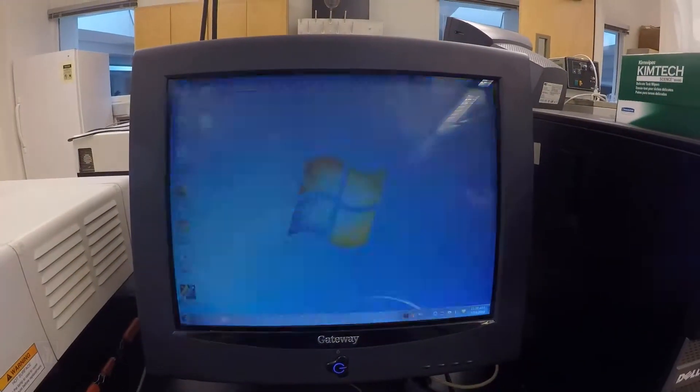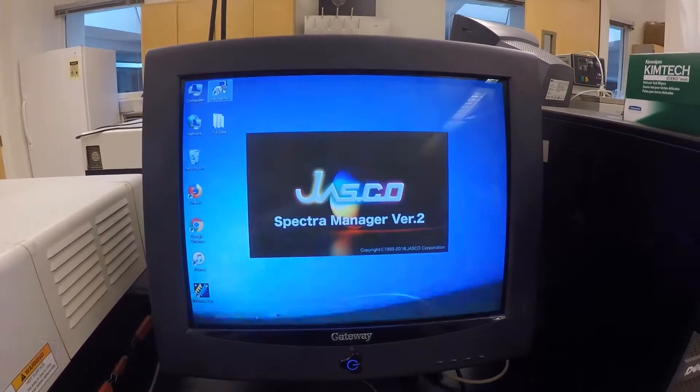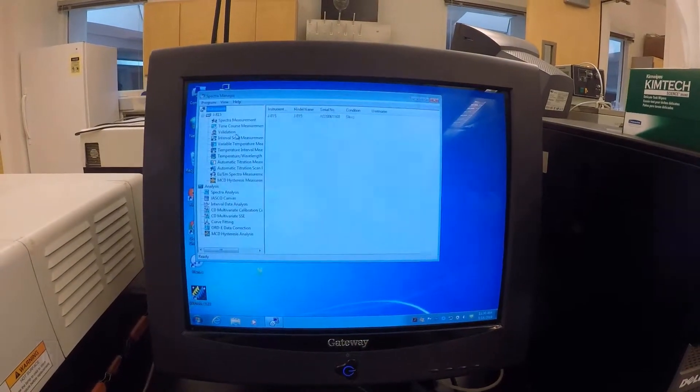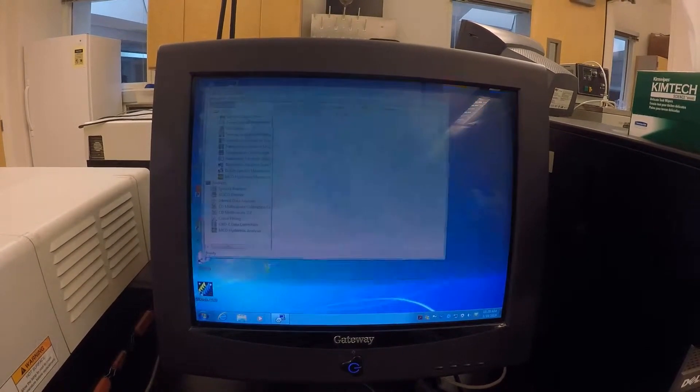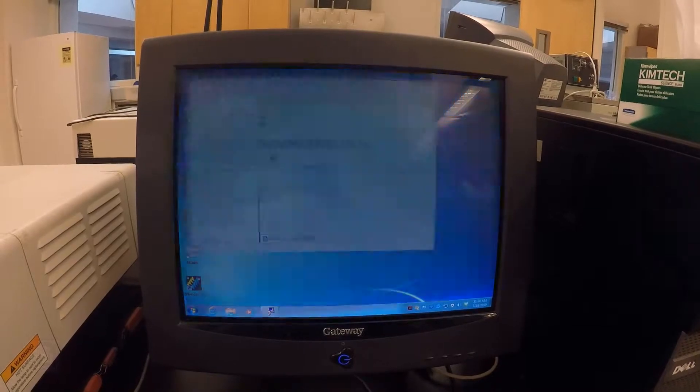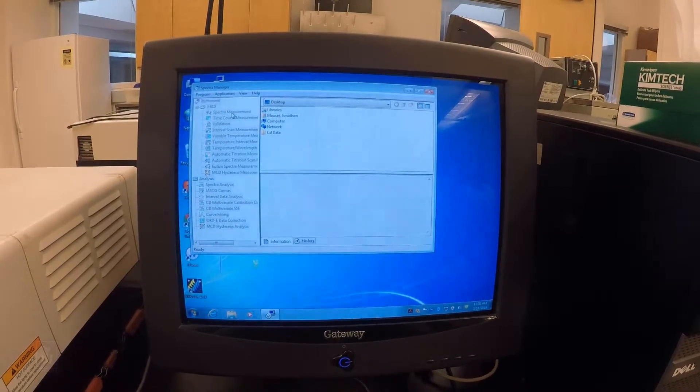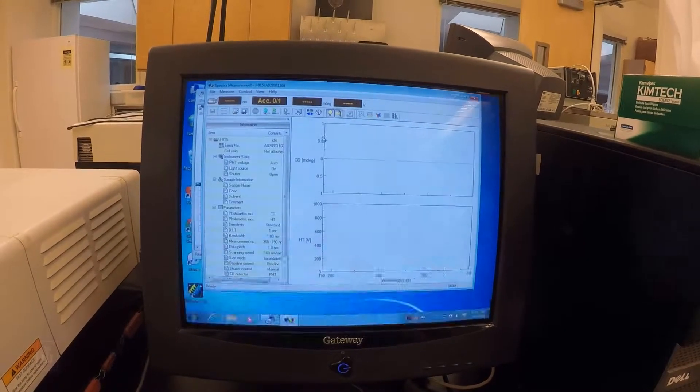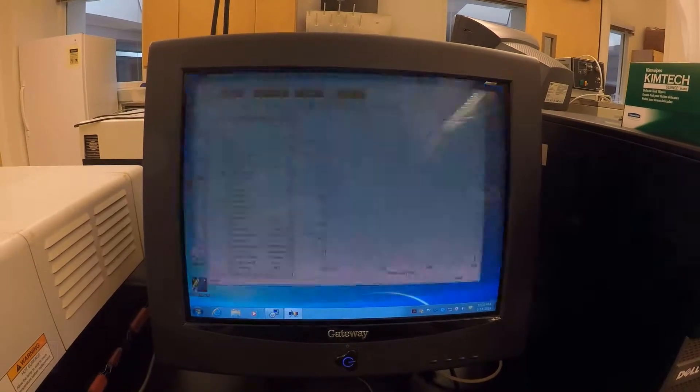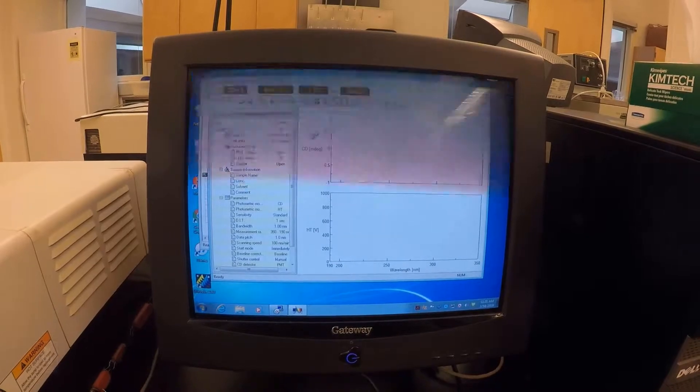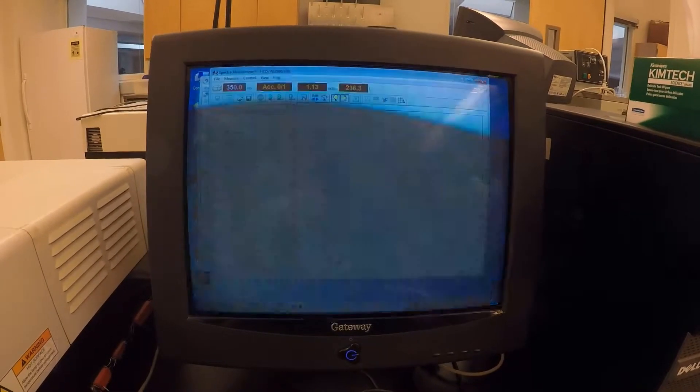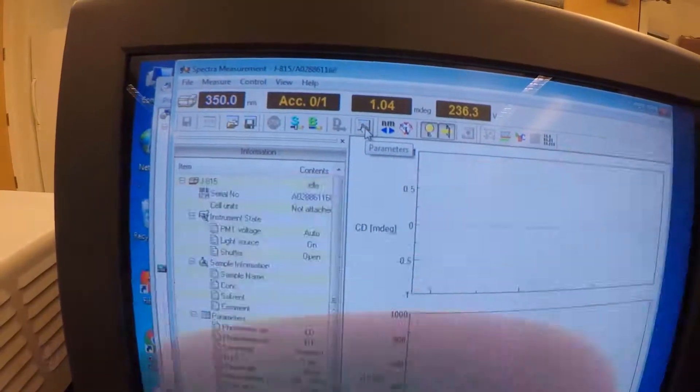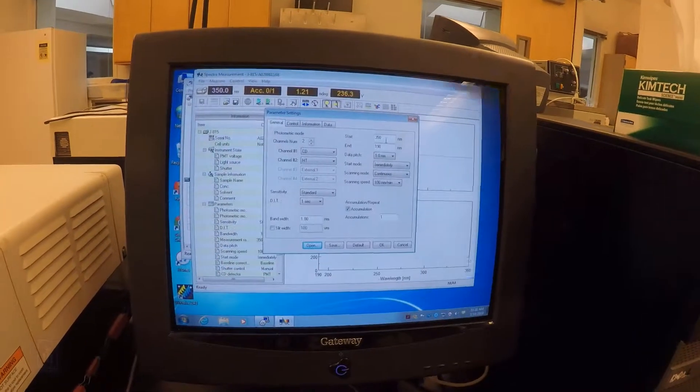When it comes to the computer, we are going to use Spectrum Manager which is up here. Spectrum Manager allows us to do all the operation of the instrument. To start with, I'm just going to do a basic CD spectrum which is going to tell us about the helical content of a protein. I'll just click on Spectra Measurement here and let it initialize. This will generally measure the difference between right and left polarized light which happens as a result of chiral complexes. So what I'm going to do first is set up parameters.